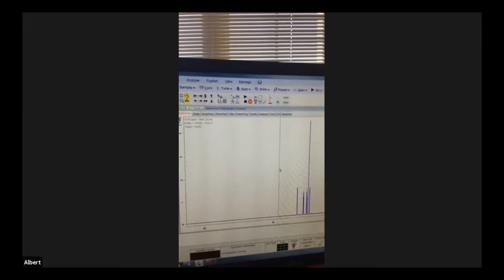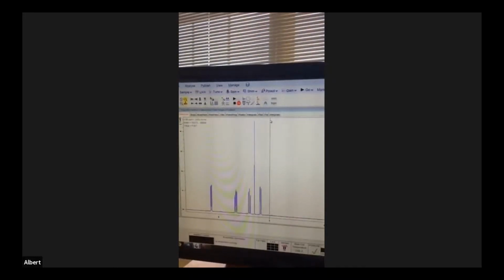Okay, stop. All right. So those of you who are watching, if you see those peaks, each one of those peaks is going to correspond to, like I showed you earlier on the notes, the ones in the back between 7 and 8. So you zoom in, hit the little magnifying glass, plus, up to the left. Right there. Okay. So each one of those peaks you see down there represents one of the hydrogens on the aromatic ring. Because remember there were 4 hydrogens on there? They're all non-equivalent, so they all give their own signal.